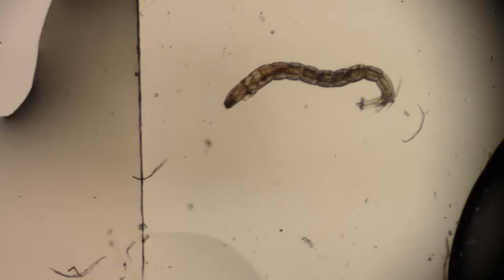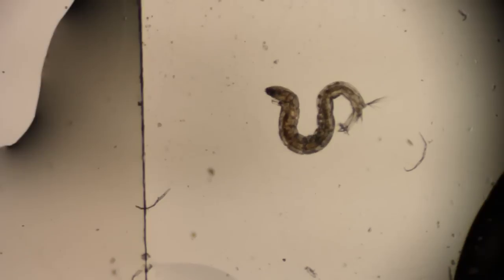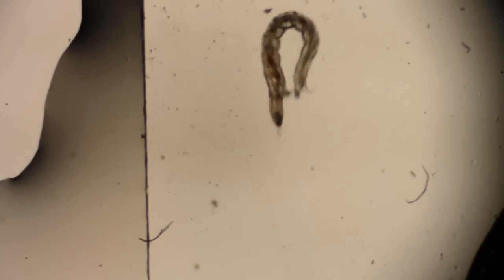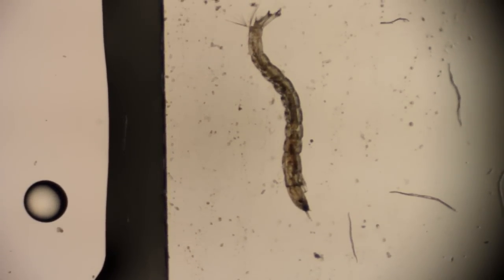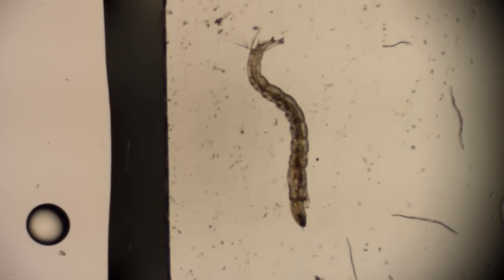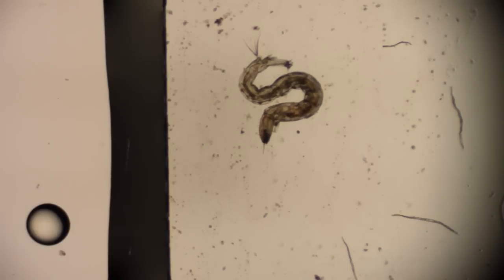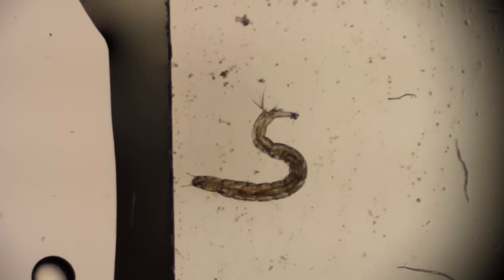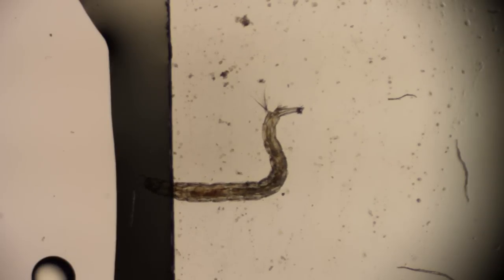The first picture was at 4X using a Nikon 4X Plan Achromat. Now we're using a 2X generic brand. I've added some Proto Slow to the water here to slow him down, because he was flipping all around like he was just a second ago.